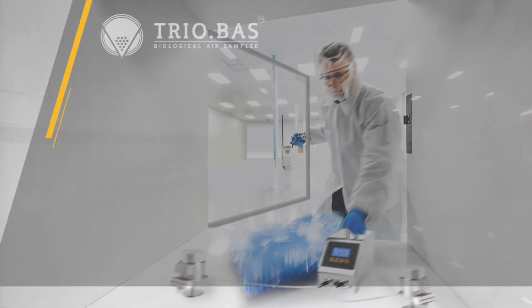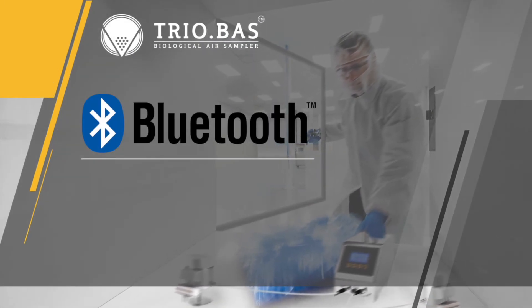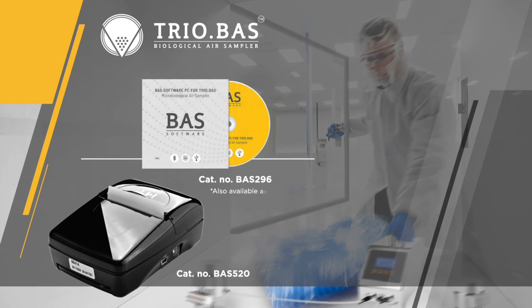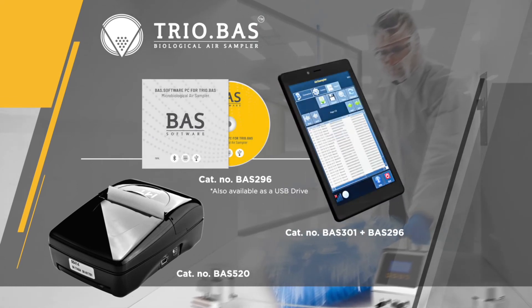The instruments are Bluetooth equipped for the capability to transfer sample data. Data transfer options include the TrioBoss Bluetooth printer, the CD software, and the proprietary tablet device plus CD software.